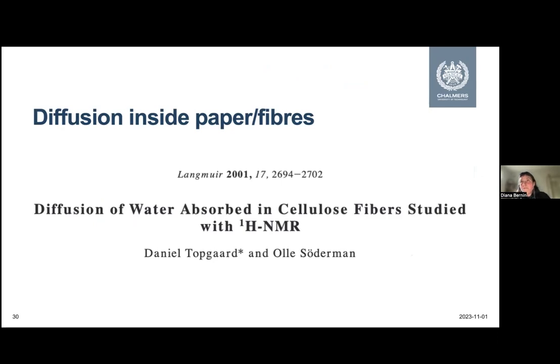And that's because the relaxation times of the water are very, very short, and there are a lot of things you have to take care of, namely that the water is interacting with the cellulose, for example, through the hydroxyl groups. And this will also add another contribution that might alter your diffusion coefficient.